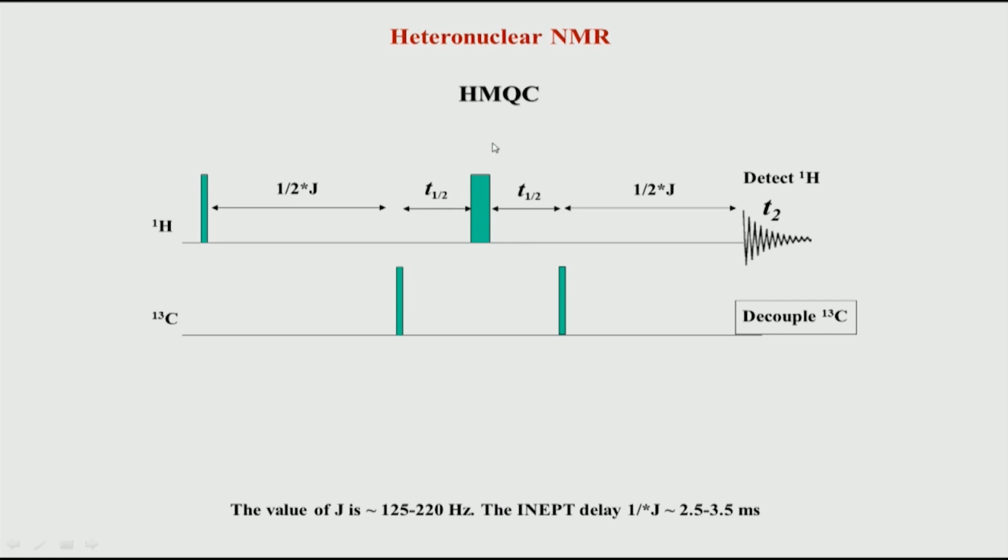That means the pulse you are applying on carbon, if you apply a 180 degree pulse like we saw in HSQC, has to cover 40,000 hertz, and that is not typically possible with a simple 180 like this. Therefore, you need a broadband, meaning a broad coverage, 180 degree pulse, and there have been a series of different methods proposed in the literature for how to achieve this.